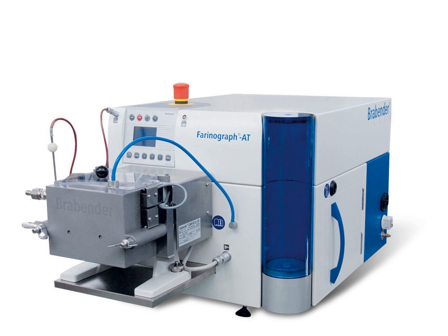Millers use the Brabender farinograph to assess the properties of the flour, to ascertain whether changes need to be made in the mill. The miller also uses the farinograph to prepare dough for further testing for extensibility after a resting period with the Brabender extensograph.